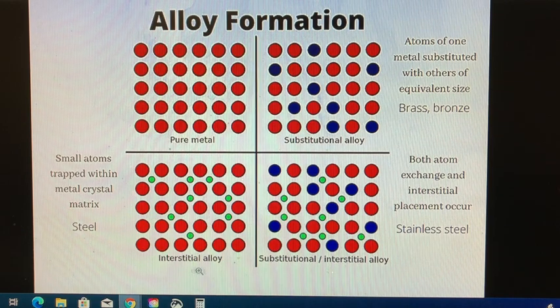In this lab, I will be showing you how to make brass. And the reason why brass this time of year is that it kind of looks like gold. In many cultures and in many religions all around the world, gold is seen as a very special kind of metal, especially in the holiday times. And alchemists back in the BC times, early days of chemistry, before it was officially chemistry, tried to make gold out of just about anything. And they thought they had something when they made brass. In that combination, you have zinc and copper combining into something else that looks like gold but really isn't.